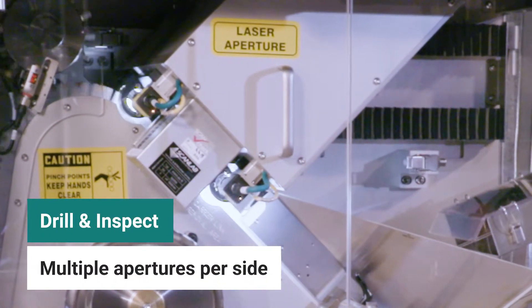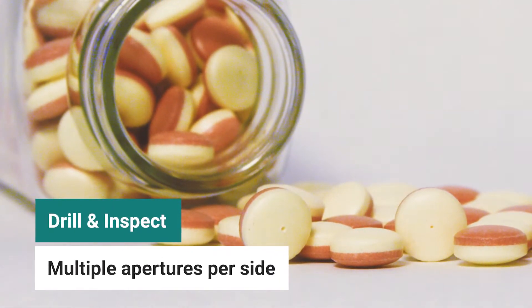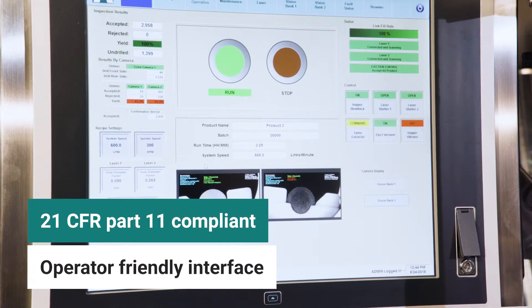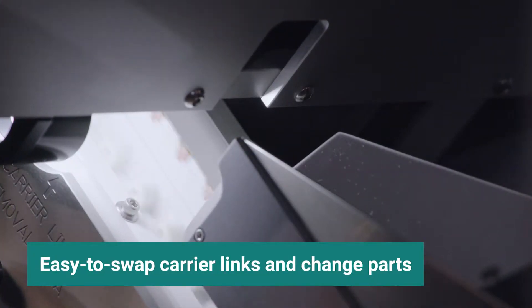The VIP is guaranteed to drill the correct side of bilayer tablets every time. Ackley's user-friendly touchscreen allows for easy operation and management of up to 25 recipes, and changing between products is simple.